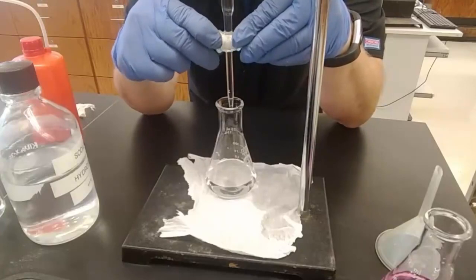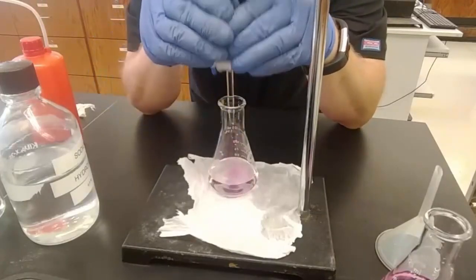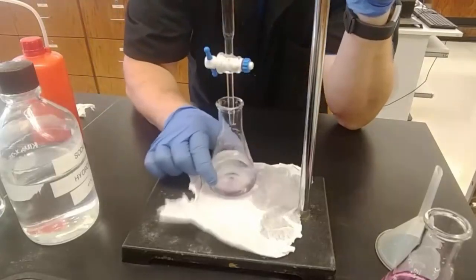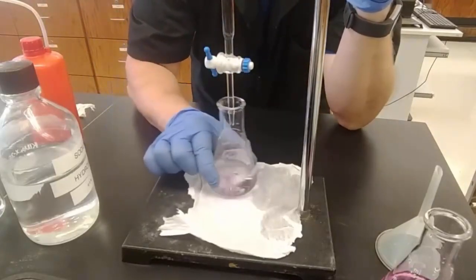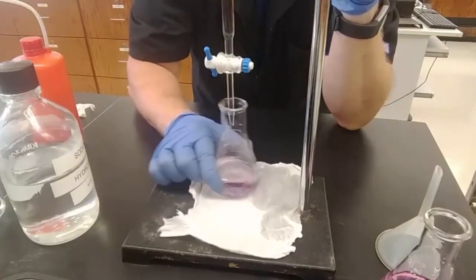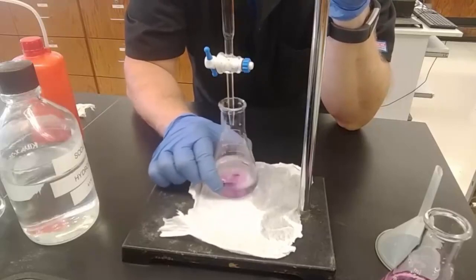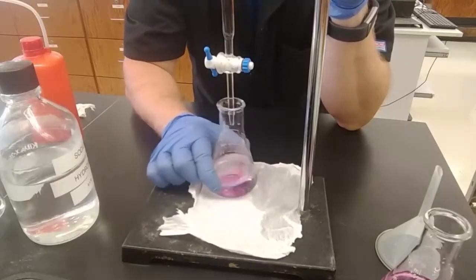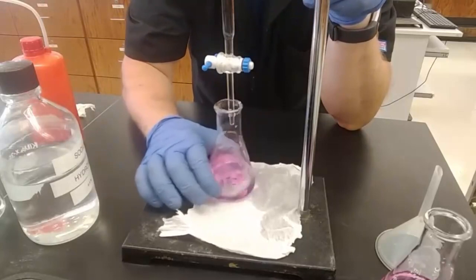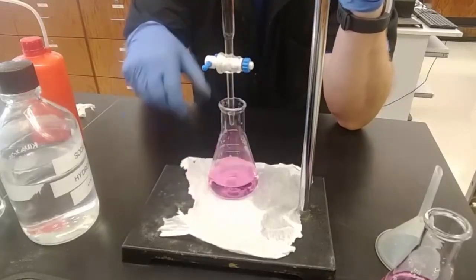So I'll get it going a drop at a time, a little slower than that. Lower it down in so the tip is in there for sure. It's turning pink, but it's going away. I am not going too far. I want one drop to turn it pink, and that's it. Oh, did I stop it exactly right? I think I might have.